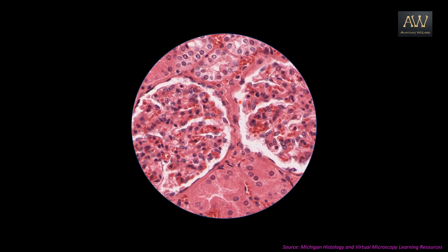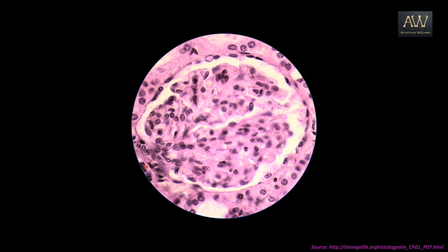Now let us zoom in a little bit more. If you can identify these flattened nuclei, you can understand that these represent the squamous epithelial cells which are at the junction of this free space and the tissue. This picture is a typical representation of the Bowman's capsule of the kidney. So this layer of epithelium is the parietal layer of the Bowman's capsule, and this free space is actually the urinary space. The tissue in the center is nothing but the glomerulus. The thing to look out for are the squamous epithelial cells forming the parietal layer of the Bowman's capsule.